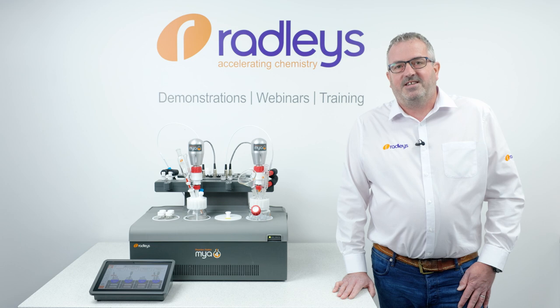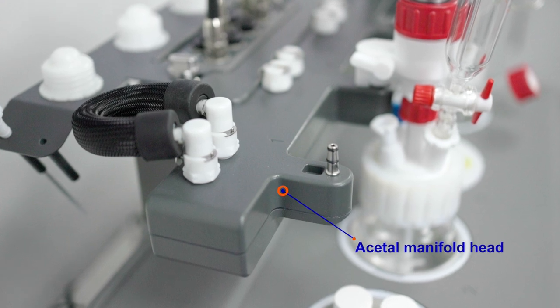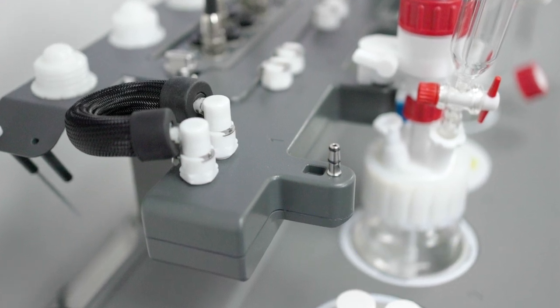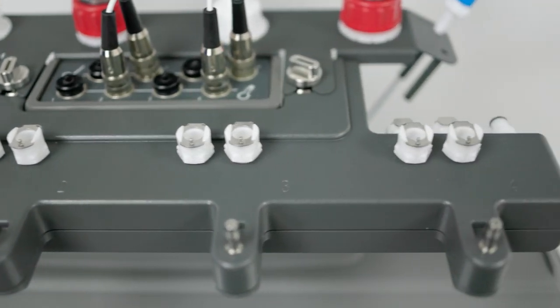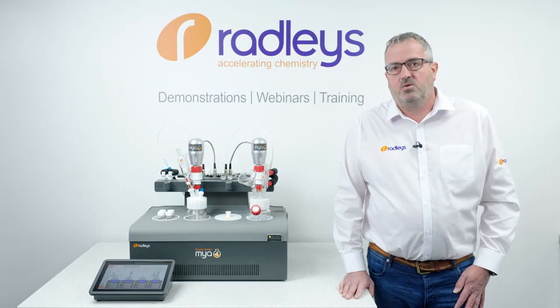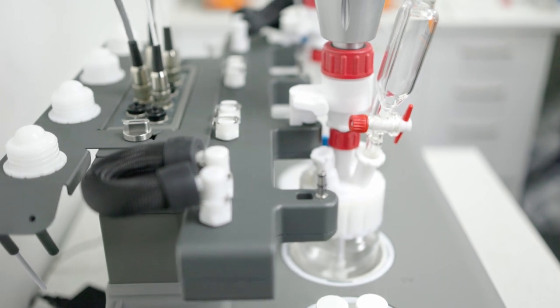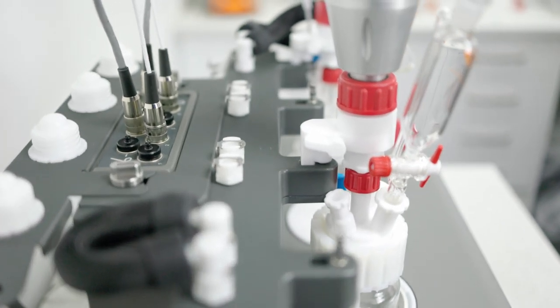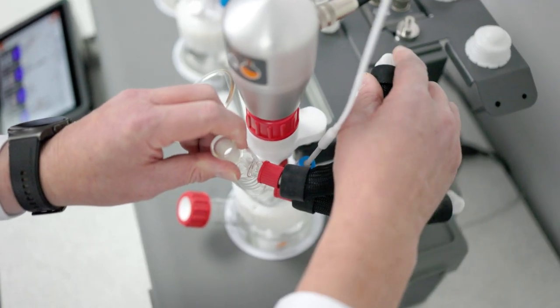The next accessory is our acetal manifold head. The new manifold is constructed from acetal copolymer with an epoxy paint finish. As an insulator, it will protect external surfaces from the cooling effects of the internal cooling supply for the reflux condensers. This, in turn, virtually eliminates any condensation from humidity in the air. We've also updated our condenser tubing.